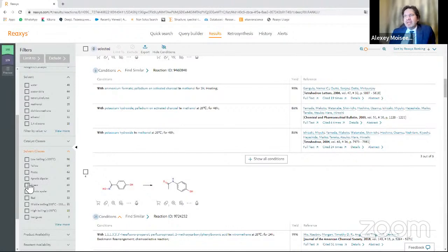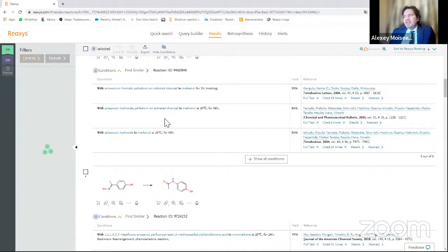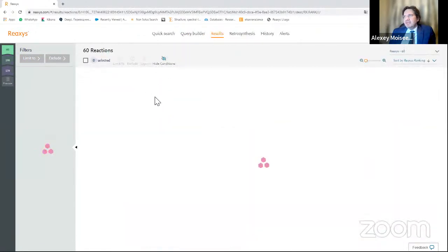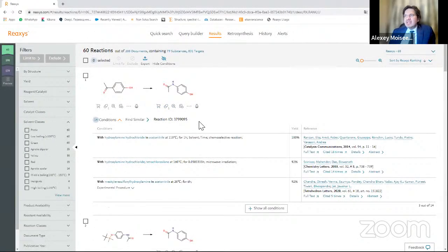For example, you prefer green solvents, which are more effective from the point of view of green chemistry. Click on green solvents, limit to them, and we will filter only chemical reactions and only ways of synthesis with green solvents. So it's a really effective tool to optimize your chemical synthesis, to find chemical synthesis of the material that you're interested in.